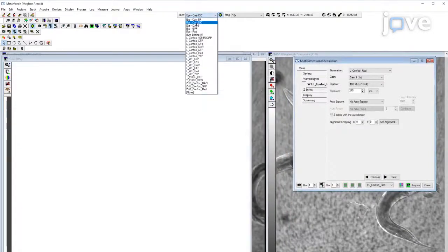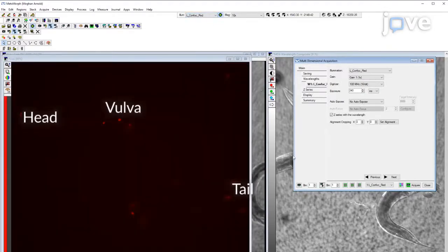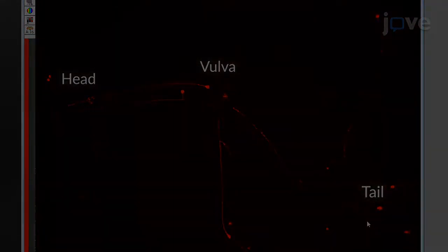Staying in the same Z-plane, switch to wide-field fluorescence viewing at 10 to 40x for the chosen cytosolic reporter, and scroll within the Z-axis to observe the depth of the animal and the fluorescence expression in the focal plane. The head will have a fluorescent nerve ring, and the more pointed tail will contain 1 to 2 visible posterior lateral touch neurons.